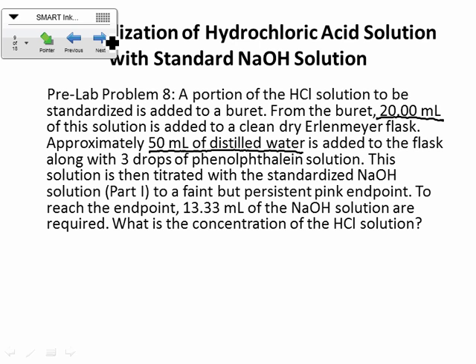But what we know, this is how much NaOH we had to add, and we know the exact concentration of that NaOH because we just standardized it, right? So we know a concentration, we know a volume, right? So that maybe would make you think about this equation, possibly. Because then we can figure out the moles of the NaOH that we added into that solution, and that's going to help us figure out the moles of the H+. All right, so we've got, I keep forgetting our concentration. It's 0.153, right?